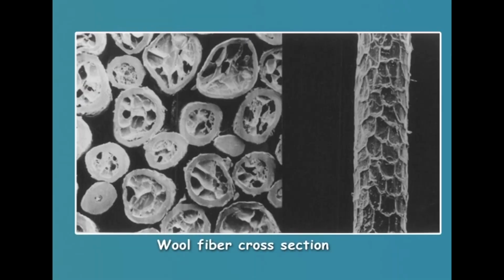Due to variation in diameter, a large number of samples have to be observed to get a representative value. Since it is a time consuming method, the latest instruments measure the diameter of 5000 to 10,000 samples in a minute by using a microprocessor. In this method, samples, that is the fibers, are placed on the platform and the microscope is used to magnify the images. These images are analyzed and the fiber diameter as well as linear density is calculated automatically.